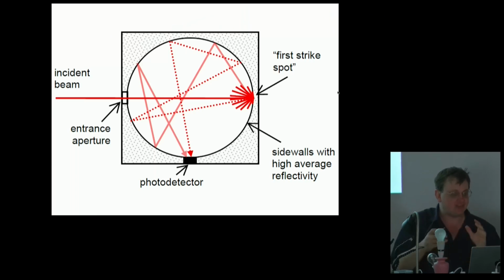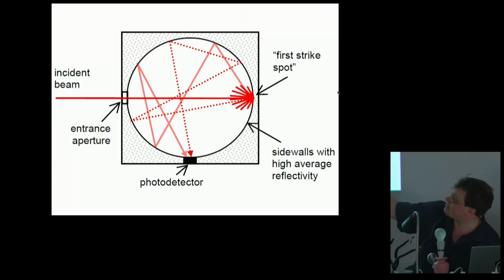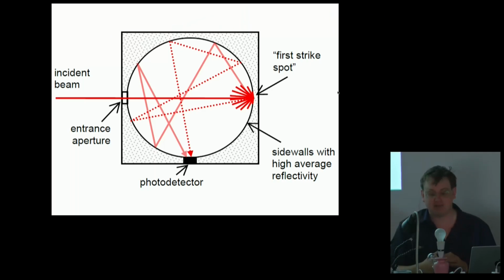And what it is inside is this spherical cavity that has a white coating that reflects a lot of light really well. And so what happens, if you put light in one port of the integrating sphere, you can see that, up here, it then bounces around the inside loads and loads and loads of times before coming out any of the output holes. And that means you get a lovely, lovely diffuse beam of light. So it's uniform light across the whole of this port.